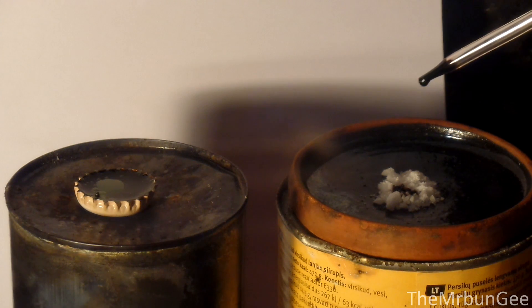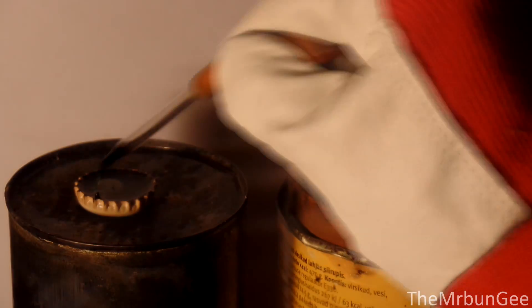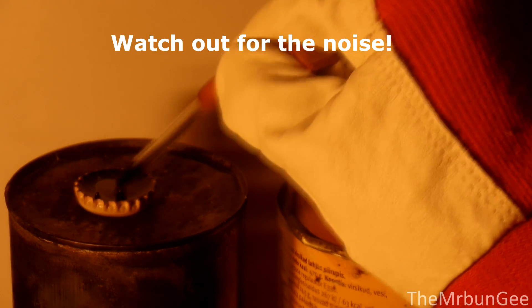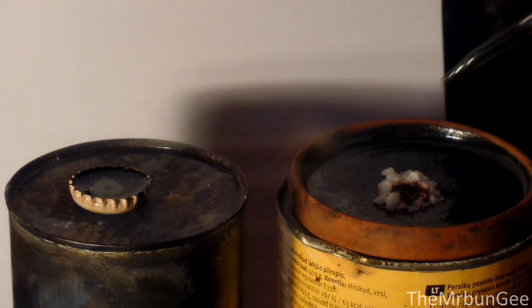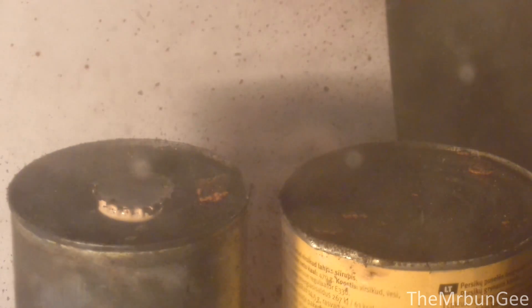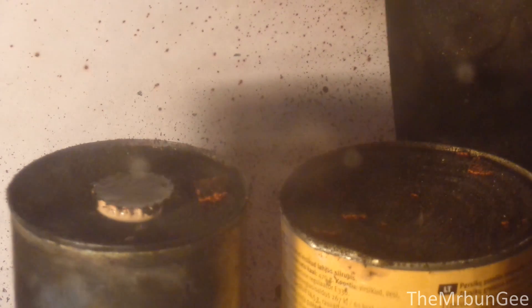First drops did not seem to do anything, so I tried hard to get as much heptoxide in the pipette as possible. That was loud and destructive — it broke my clay dish and exploded my pipette.